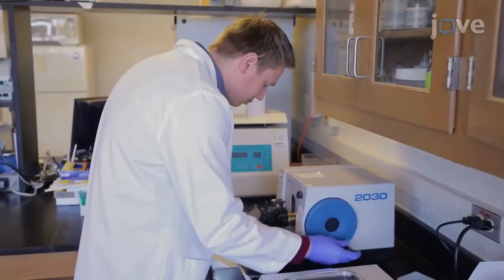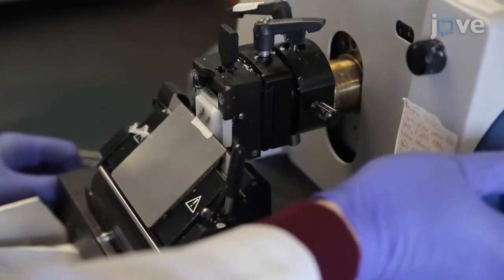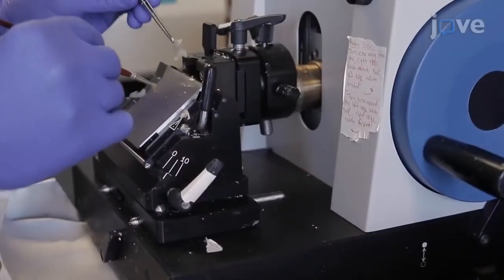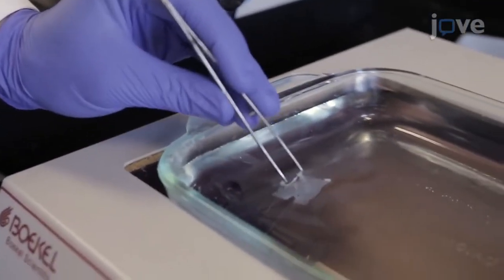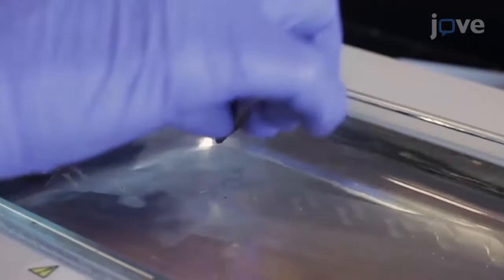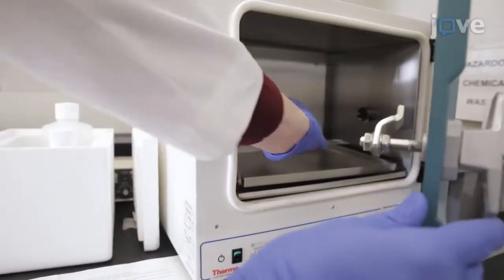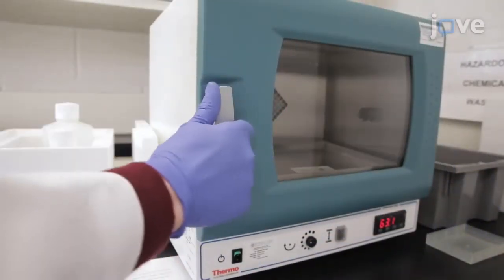To acquire tissue sections, use a microtome to slice 4 to 5 micrometer thick sections of paraffin-embedded temporal arteries, floating each section in a 40 degrees Celsius water bath as they are obtained to remove wrinkles. Use glass microscope slides to capture 3 sections per slide, and warm the slides on a warming plate in a 60 degrees Celsius oven for 60 minutes.